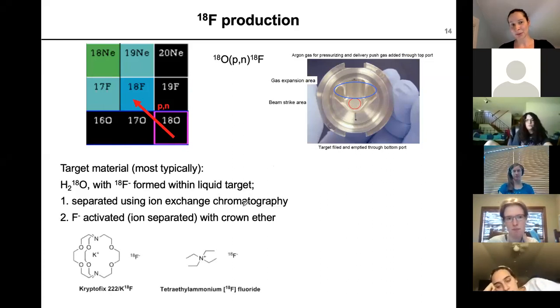So what we start with is, of course, a mixture of the target material, oxygen 18 enriched water, and it will contain sub-picomole to picomole amounts. As we know now, people usually make curie amounts of fluorine 18 when they first make it on a cyclotron these days, so we probably have almost a nanomole. That still is not a whole lot if you think about it. But we may have almost a nanomole of fluorine 18 that starts to decay very rapidly.